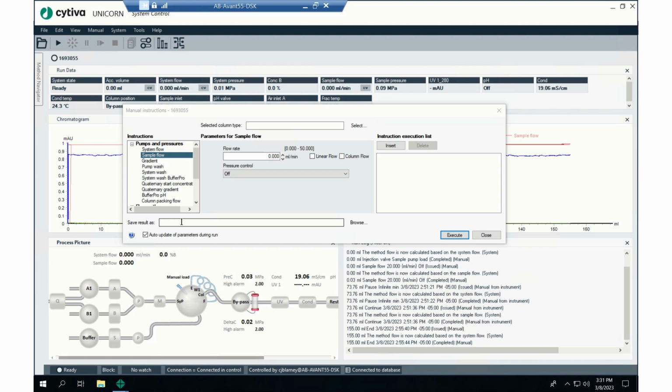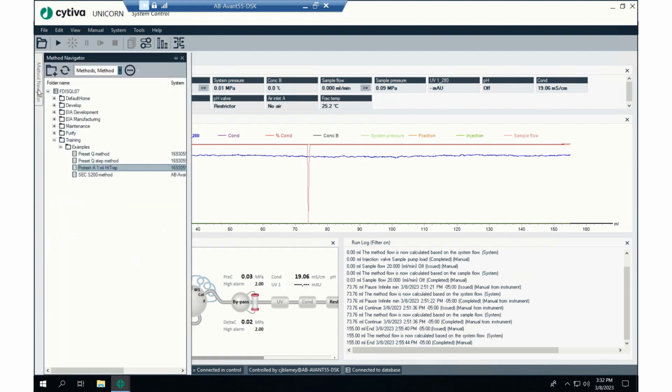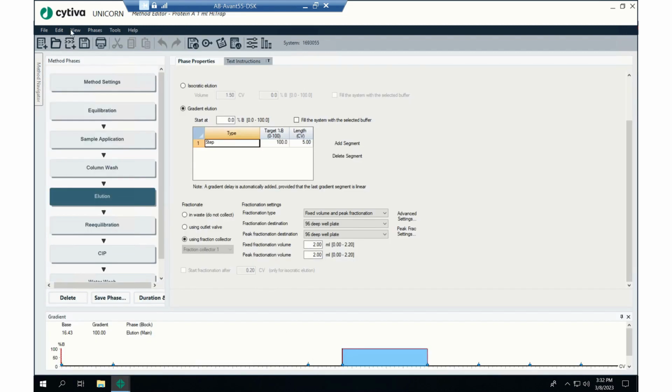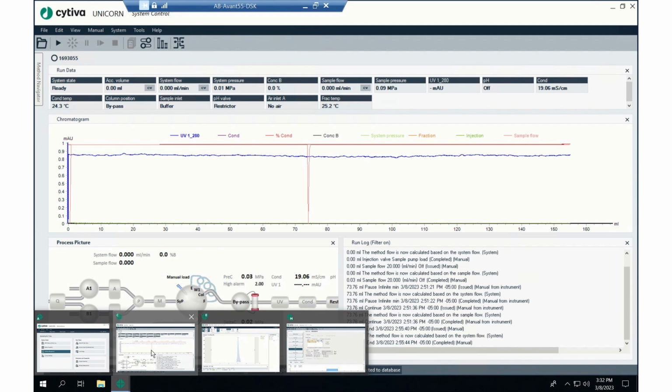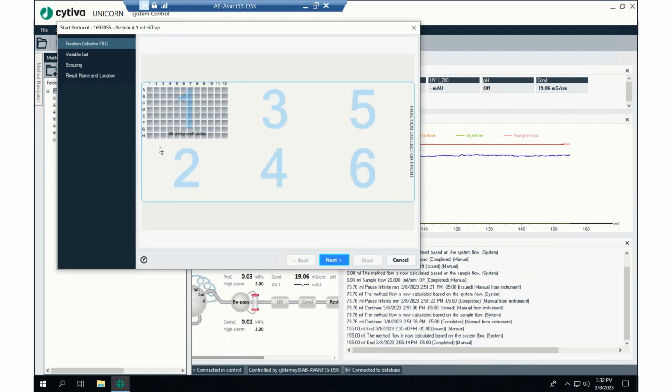Now we're ready to start the method. So let's close this out. Then we're going to go to the method navigator. Actually, let's go to the method editor really fast and just make sure we've saved everything. Save, all right. Control, method navigator. We're going to start this just like normal. I just double clicked on it.